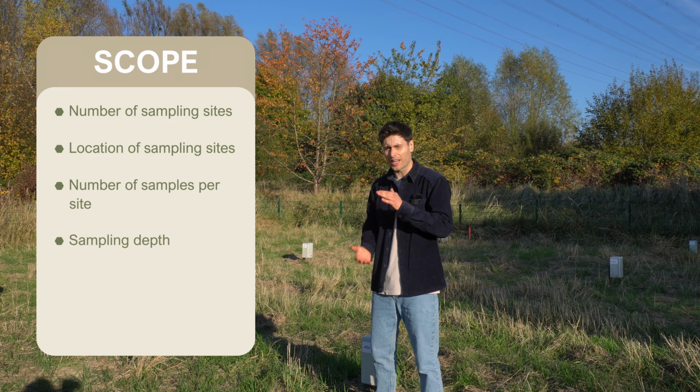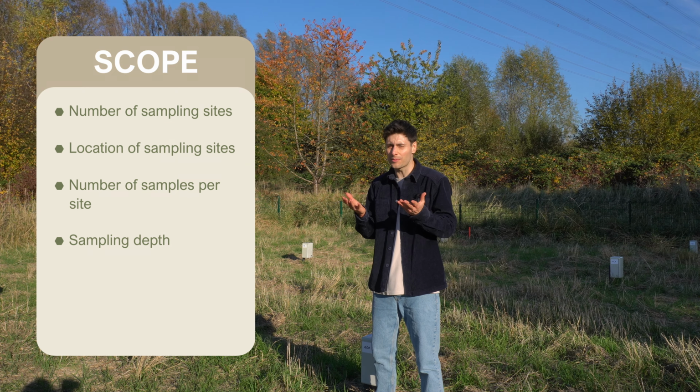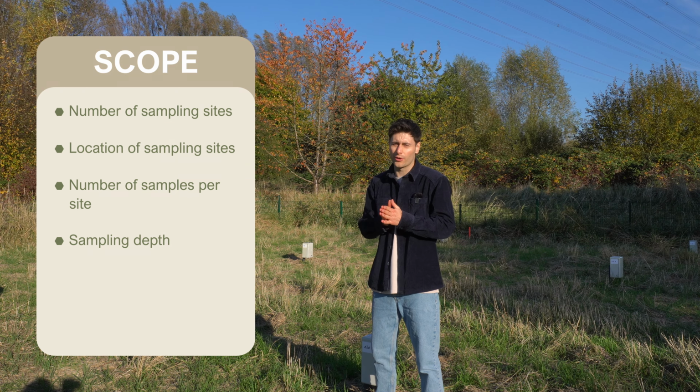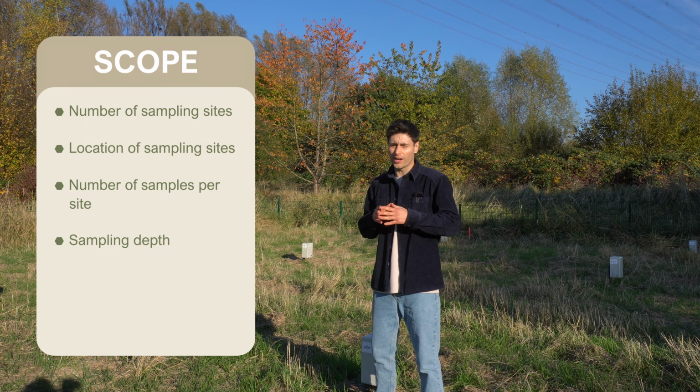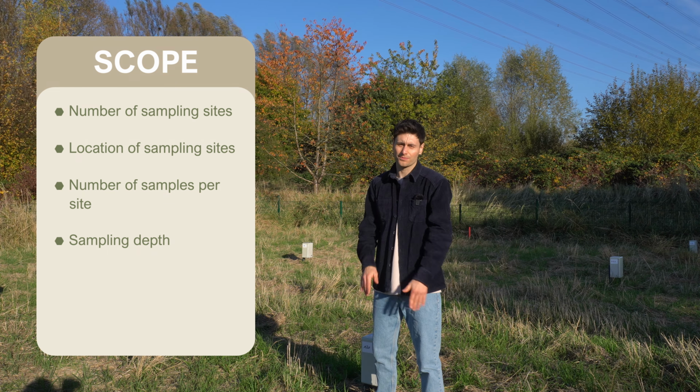What is the sampling depth that you are interested in? Is it the topsoil of around 20 centimeters, like we are showing you in our examples today? Or are you interested in deeper soil horizons, which might need specialized tools?